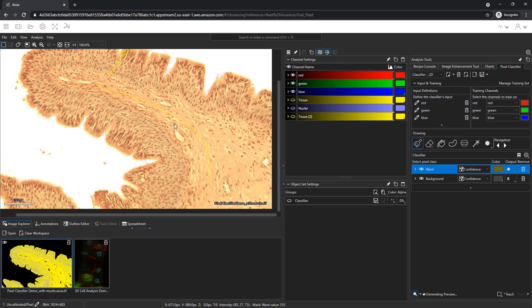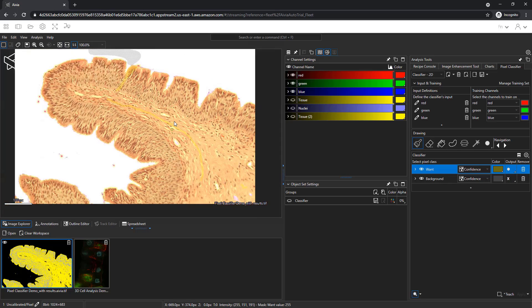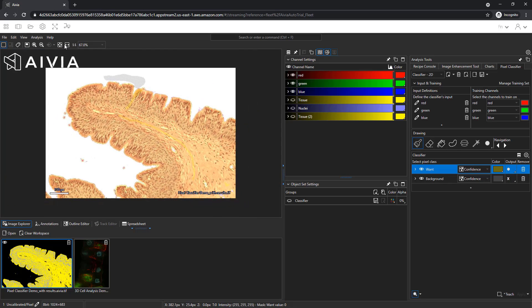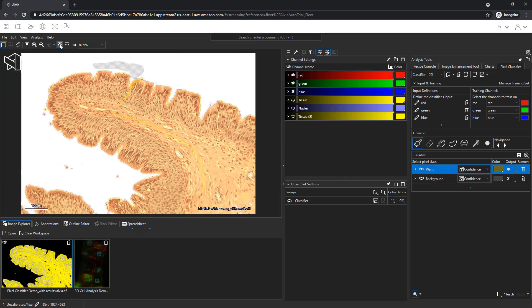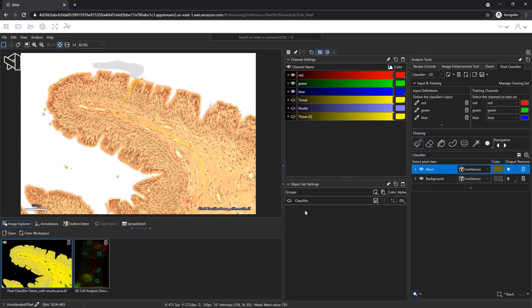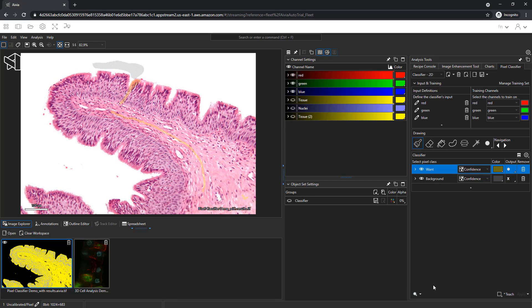I can zoom out and look at the whole image by clicking on this button above the image. It looks like the yellow region covers the entire tissue area. I will turn off the preview and click teach to train the pixel classifier.